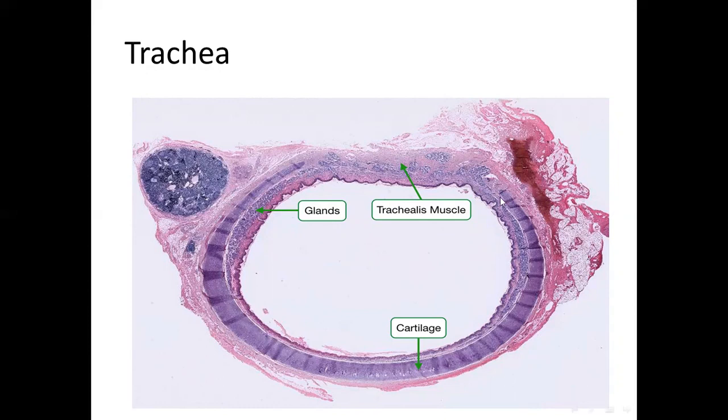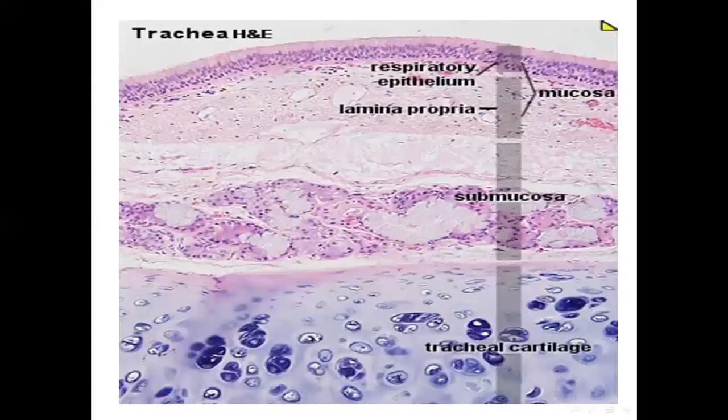زين. هذه المنطقة عندنا المنطقة اللي تربط لنا ال two ends of these hyaline cartilage هي تكون muscle. هي muscular layer. هاي اللي تربط لي two ends of these cartilage نسميها trachealis muscle. تمام. طبقة الأدفنتيشيا هي تكون responsible for anchoring the trachea with the adjacent structures like the esophagus and the connective tissues of the neck. يعني هي تربط لي منطقة trachea with the other connective tissues of the neck and with the esophagus. تمام. زين. هذا فيما يخص عندنا التراكيا.